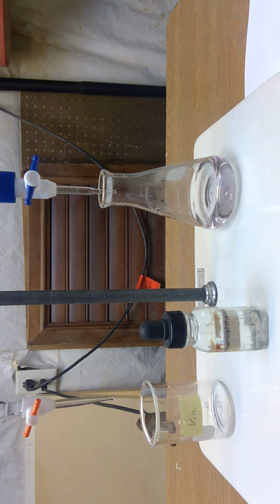So we're at 40 point, that's about 40.70. Okay, so our ending point for our third trial for the NaOH is 40.70. For our vinegar, it's 36.00. So we have 2.00 for every single one of these. And then for each one of these, it's very light pink.